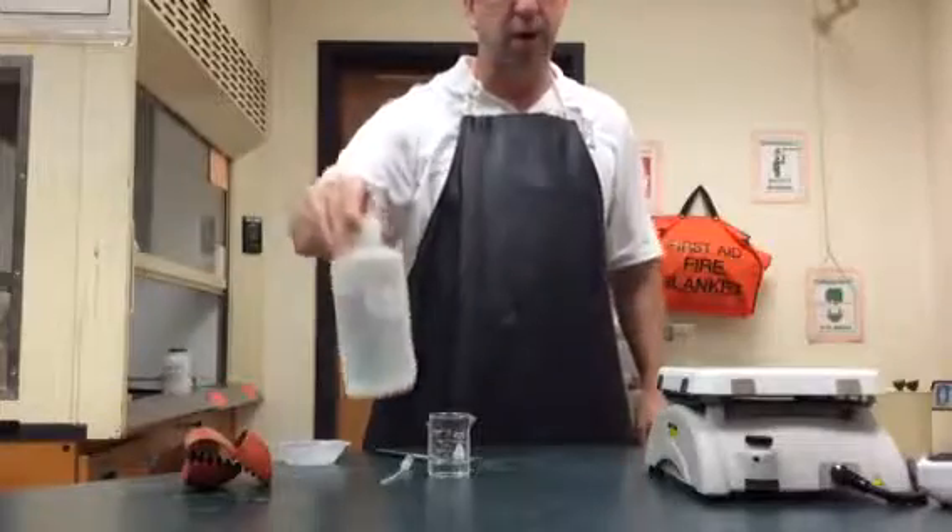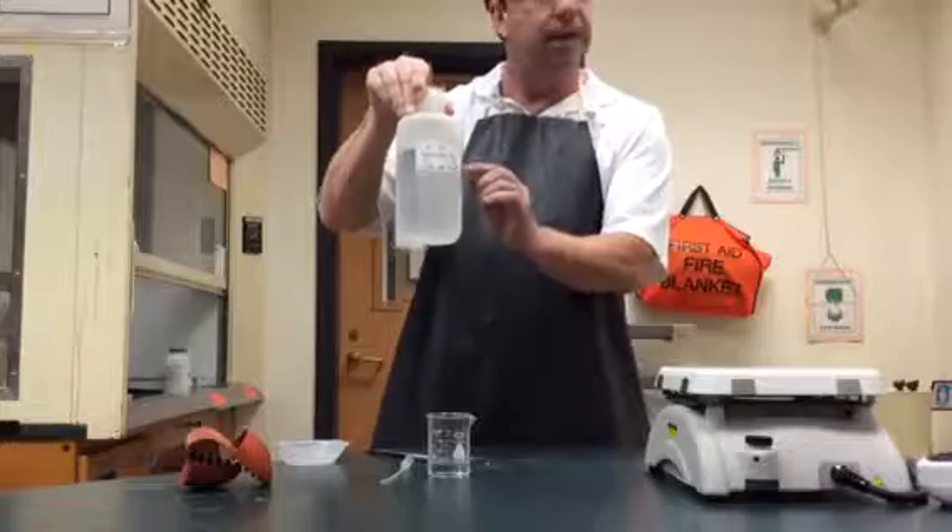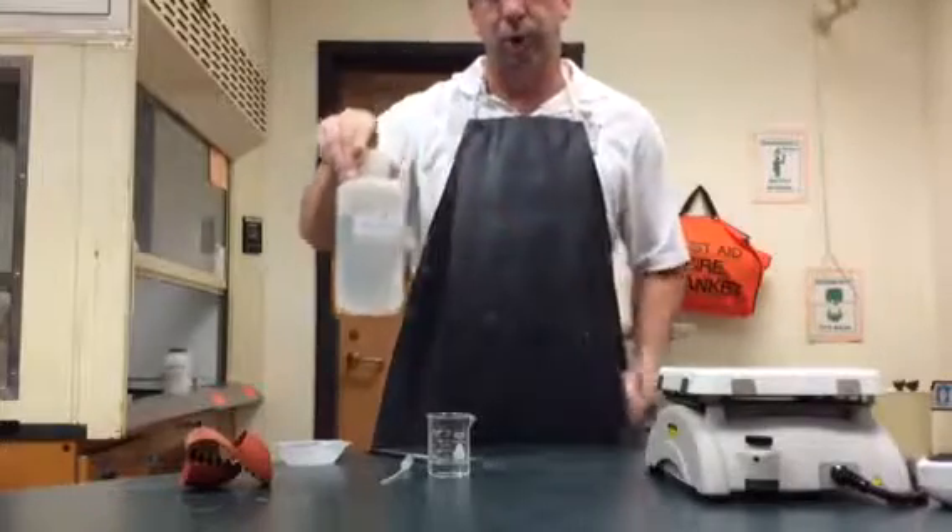Now the question you might ask yourself is: where is the water? Well, the hydrochloric acid is not pure — the hydrochloric acid has some water in it.